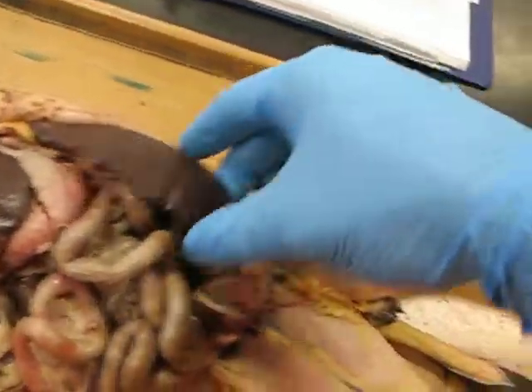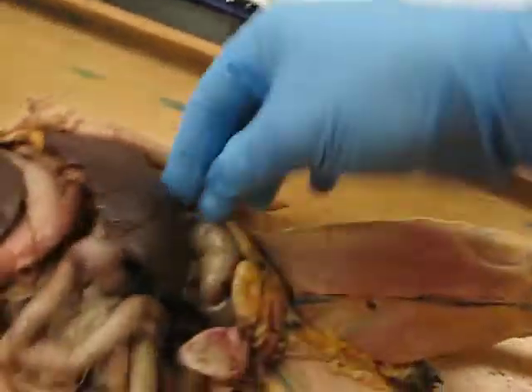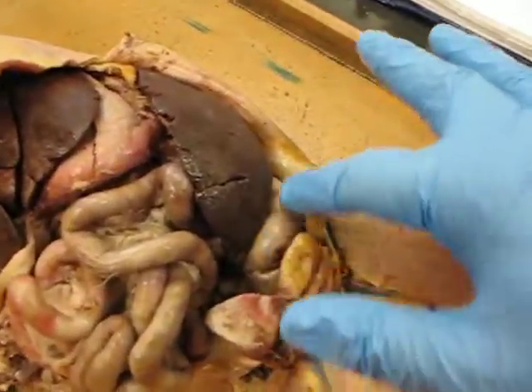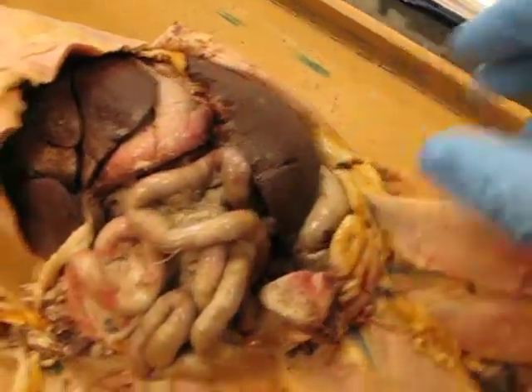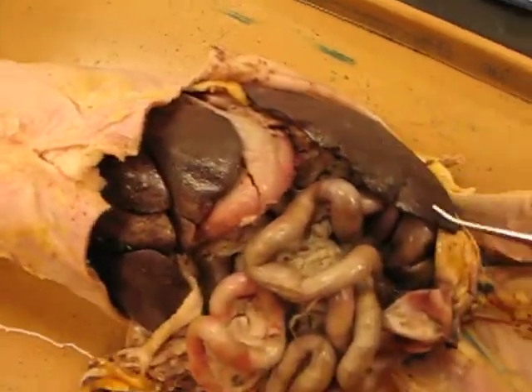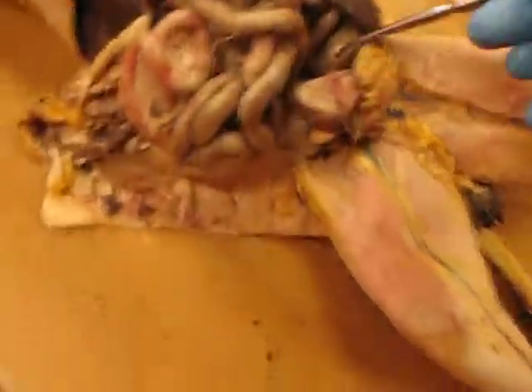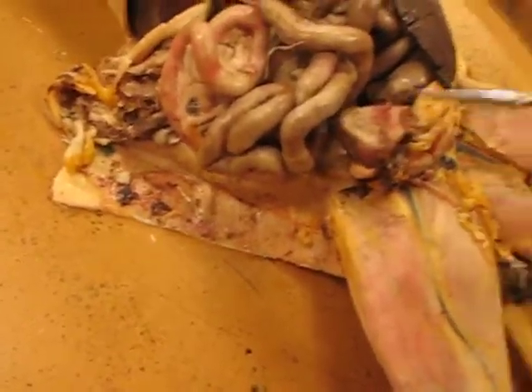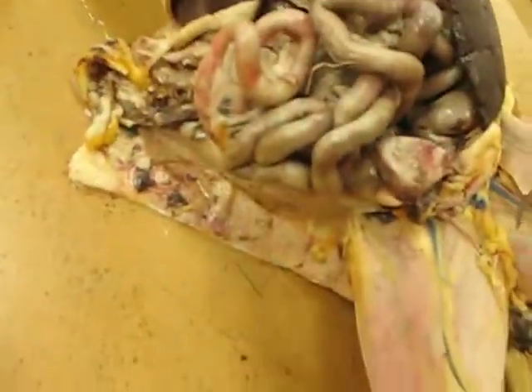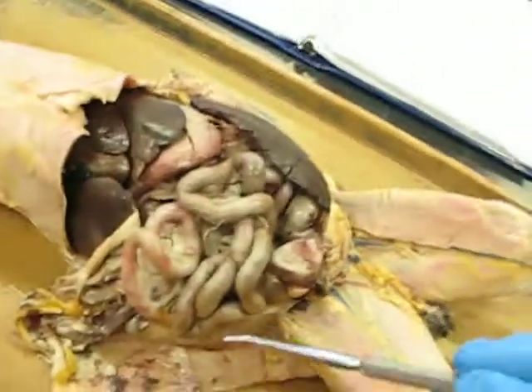And then over here, you have to trust me on this, it follows through. This is the descending colon right there. Here's your spleen, this large structure. This is the urinary bladder. Down below here we have the rectum, and then further down to that we have the anus.